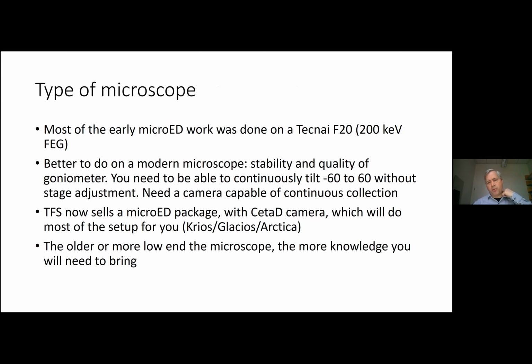There was a question about what type of microscope. Most of the early MicroED work was done on a Tecnai F20, which is a 200 kilovolt FEG microscope. This actually came up. Tamir recently gave a MicroED seminar in late December, his teaching course, which I went to. It was all online and it was oversubscribed. So hopefully some of you went to that if you're interested in it.